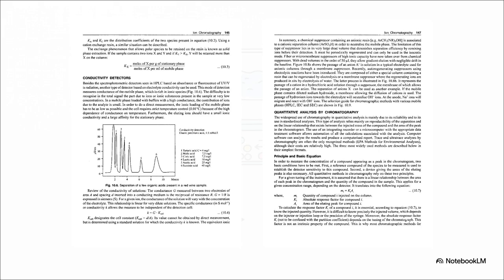By utilizing clever acid-base type reactions, it purges the highly conductive background ions from the mobile phase and turns them into plain neutral water. And at the exact same time, it converts our analyte ions into a highly conductive form. It mutes the heavy metal concert and hands our dropping pin a megaphone. Honestly, without the suppressor, reading this data would be virtually impossible.